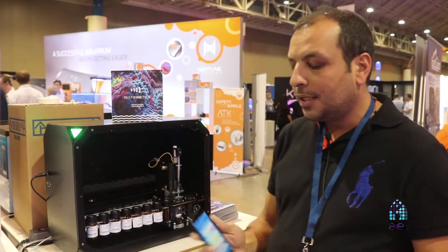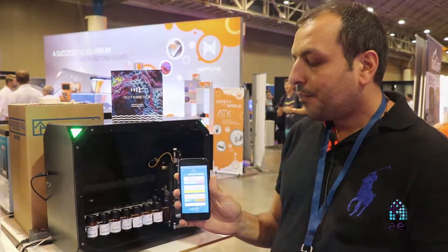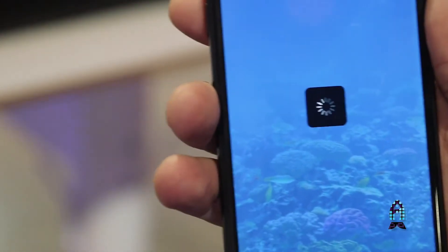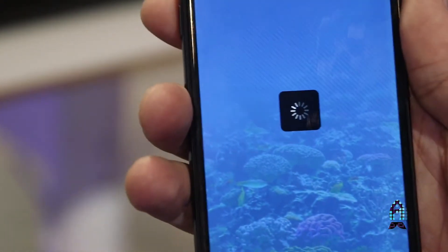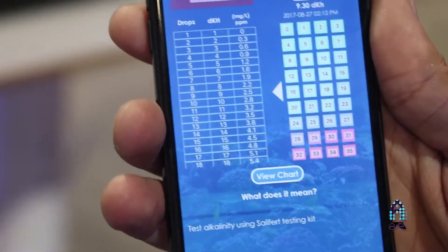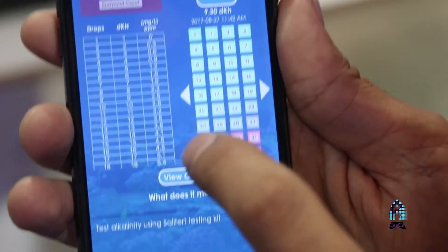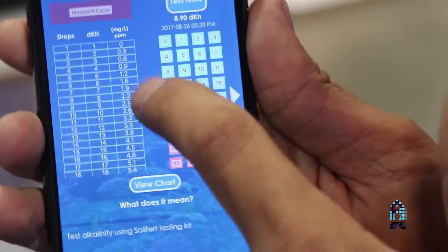You will control everything through this app here. You can see the latest test on the app. You can go deeper into each test, like alkalinity here. You will see for each drop which color it got and also the turning point of this test, and you will see here what's the dKH that you got.